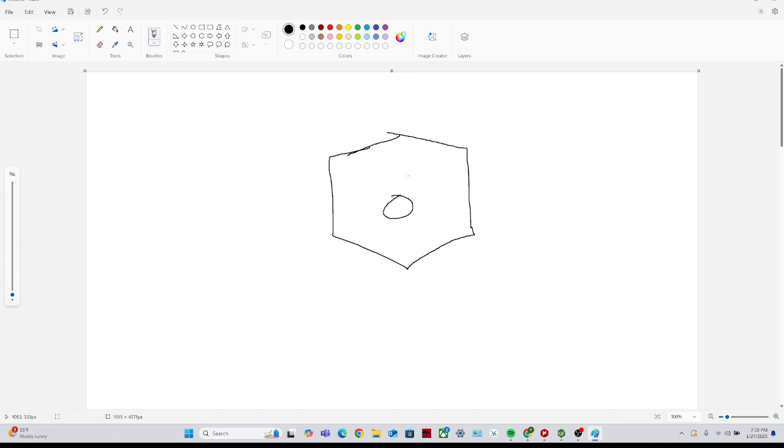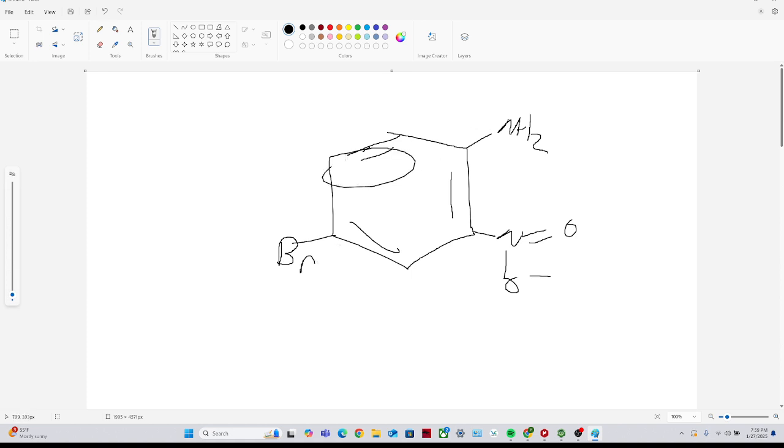So here is our benzene ring, and our compound has an aniline attached to it. It has a nitro group attached to it, and finally it has a bromo. I like to draw out the entire molecule showing the actual double bonds as opposed to a circle. Additionally, I like to show the nitro group with its actual double bonds, because it actually helps explain what I should expect on NMR pretty well.